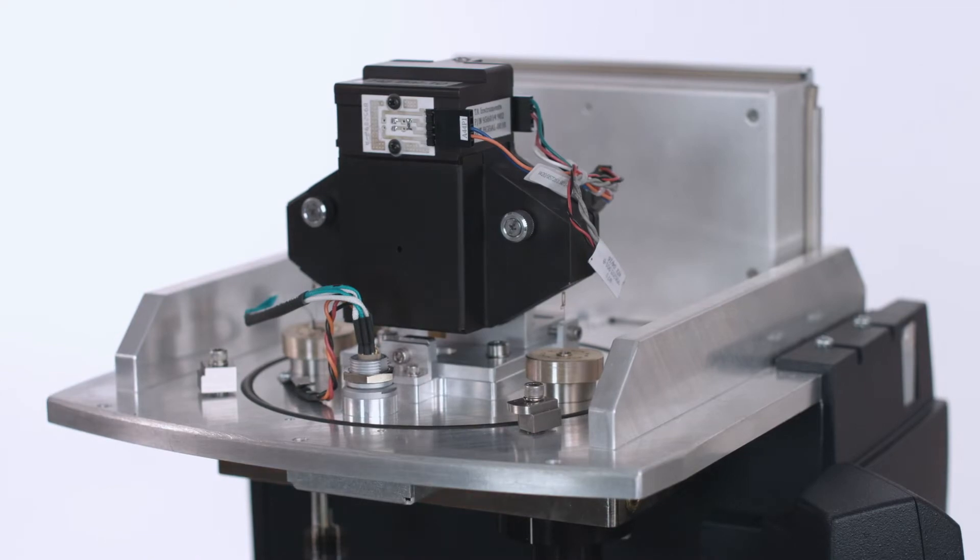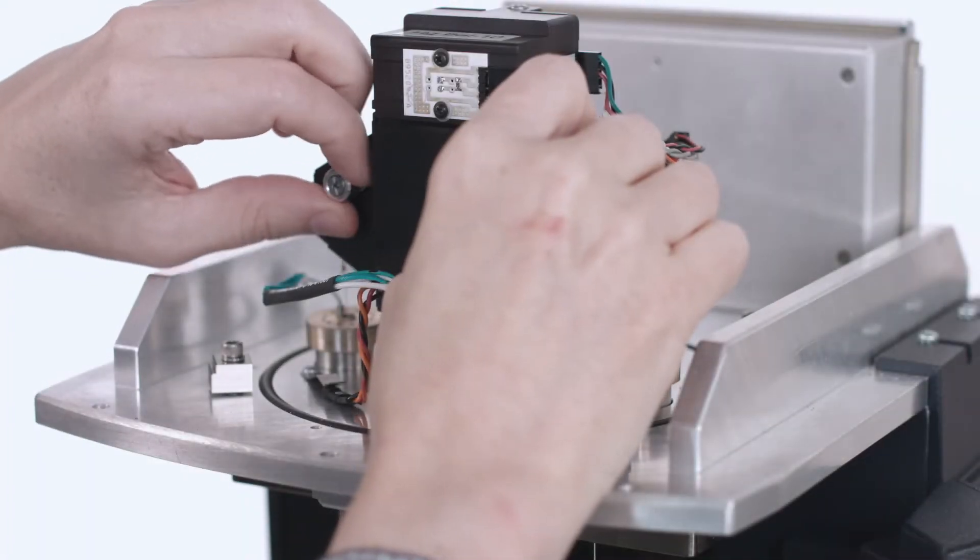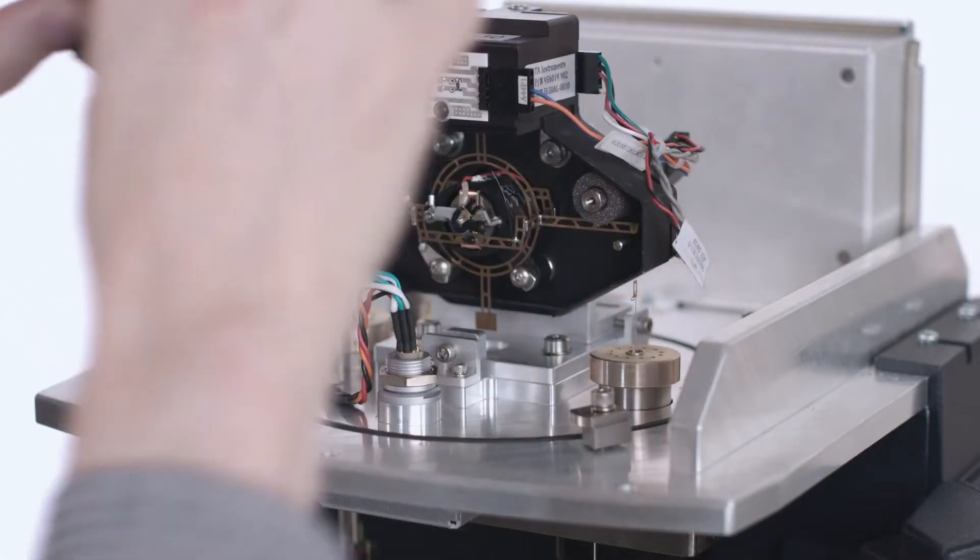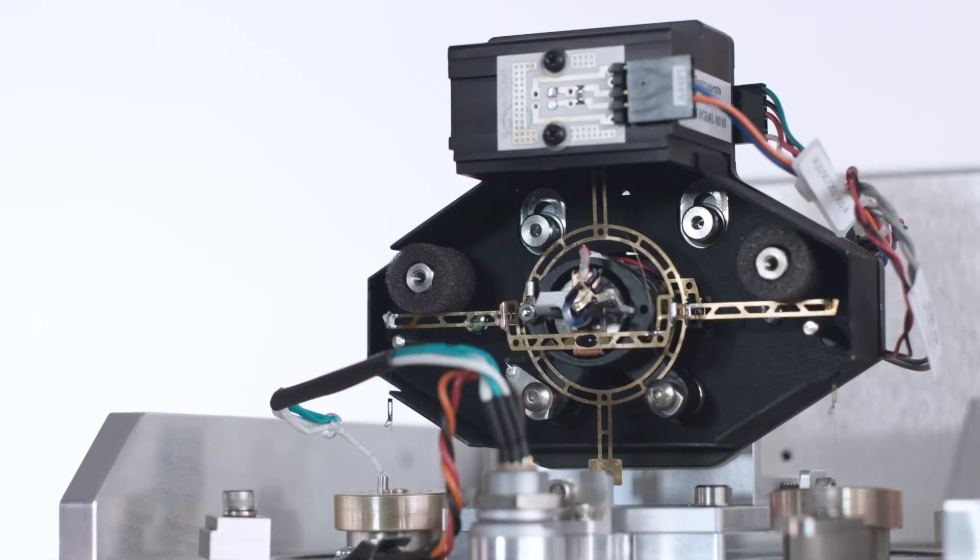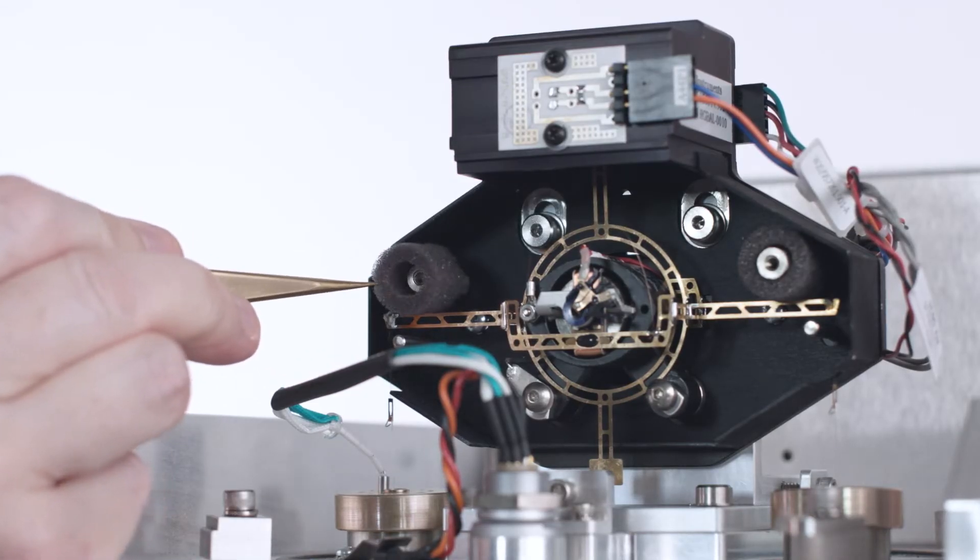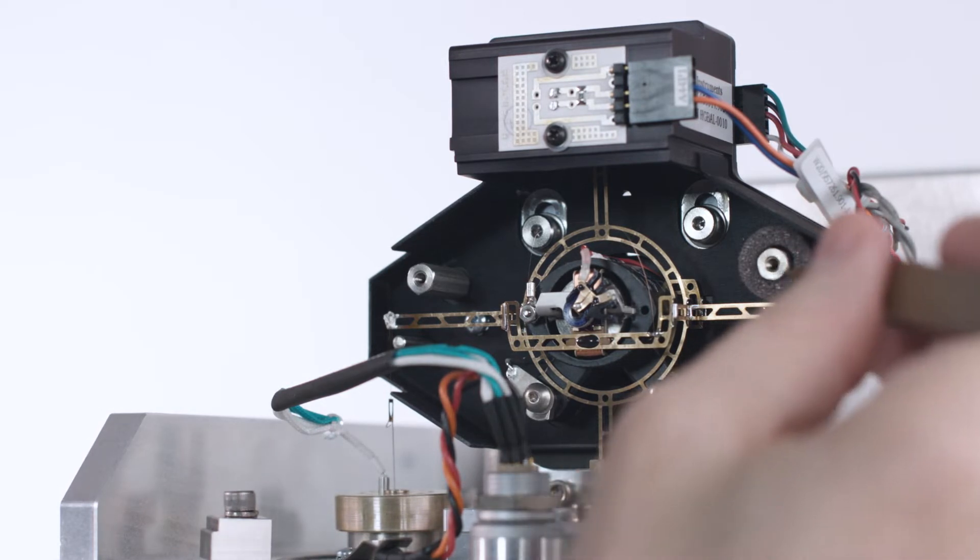Remove the balance housing by lifting straight up and loosen the two captive thumb screws and remove the balance cover plate. If necessary, remove the foam pieces within the balance.